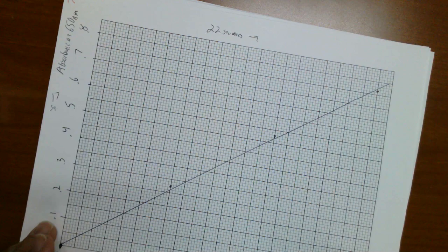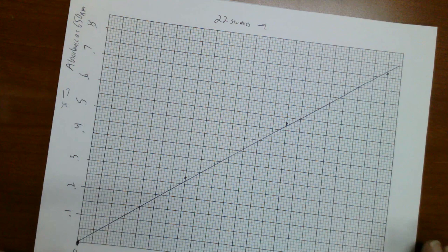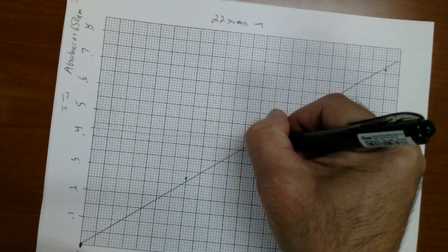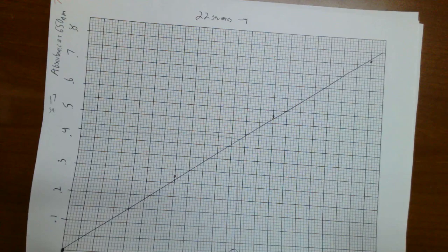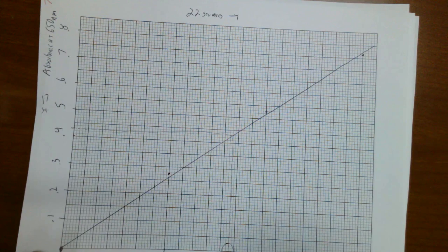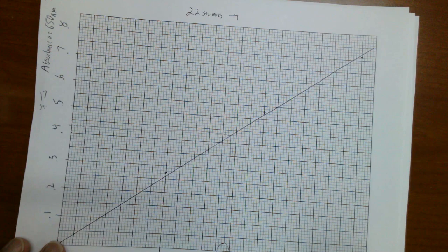Now, the way we would normally analyze a sample is we would measure its absorbance, and let's say the absorbance was here. Then we would draw a line over to our Beer's Law plot, and drop a line down to the x-axis to figure out the part per million concentration. In the lab, we're actually going to use a calculated linear equation to do the analysis.